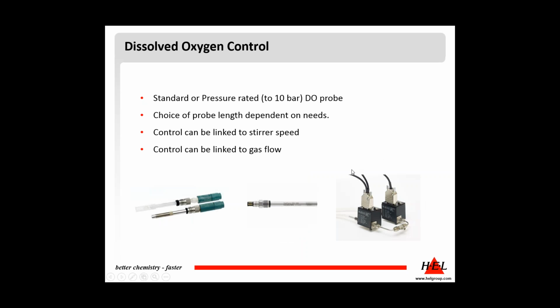Dissolved oxygen control is also standard, and this control can be used both at low and elevated pressures, depending on the type of probe we use, and it can be linked in both cases to either stir speed, gas flow of air or oxygen mixes, or both of these parameters.